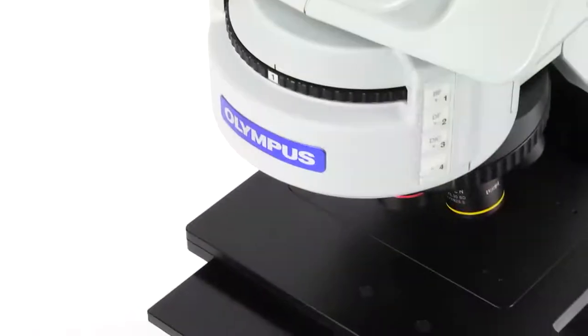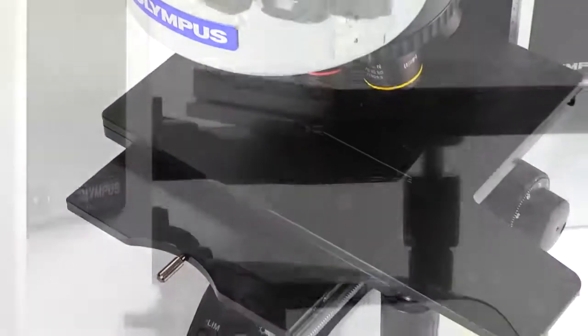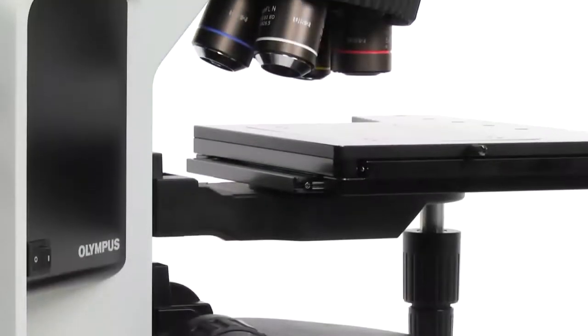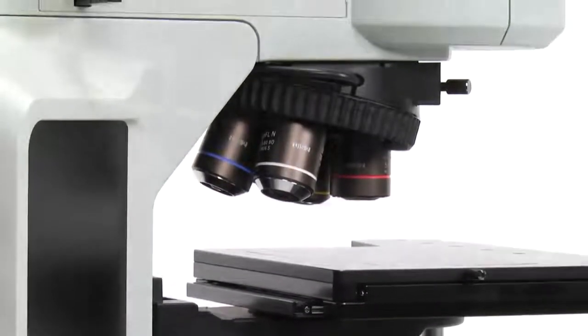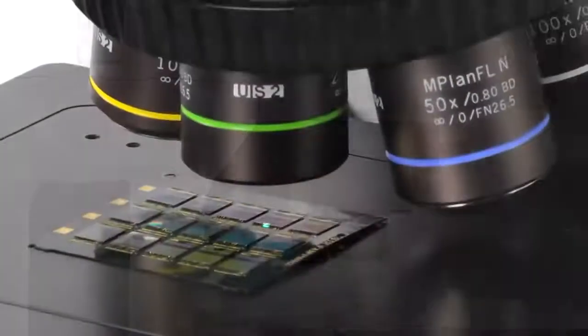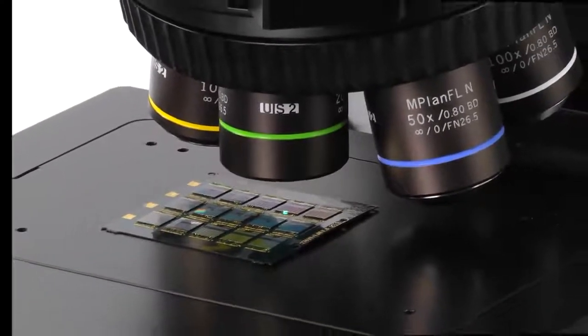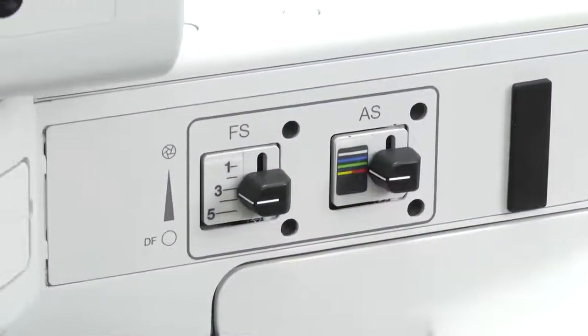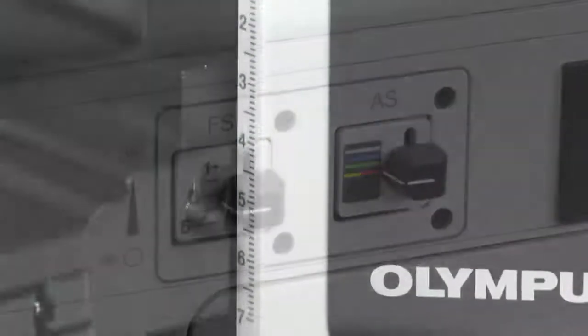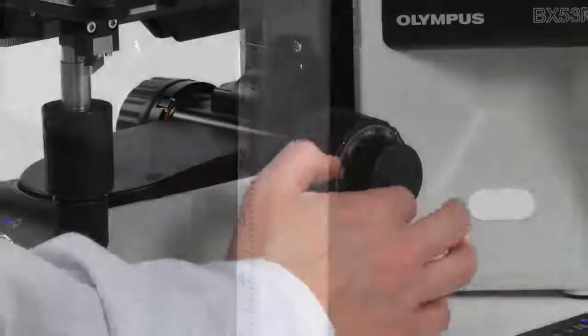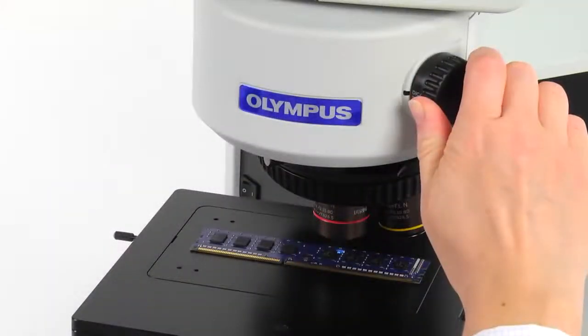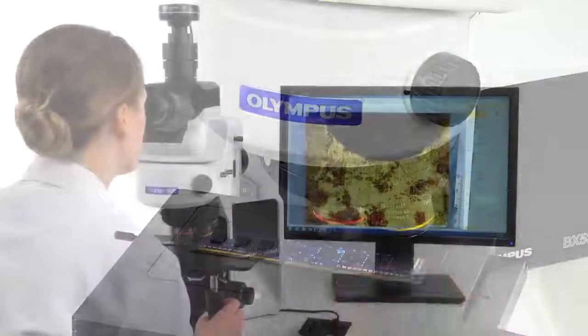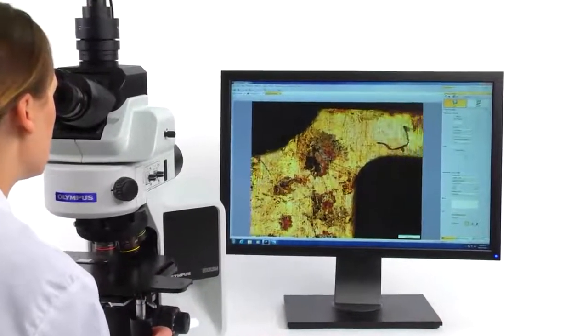The Olympus BX3M series of upright microscopes has been developed and designed for industry and materials science. Newly configured hardware guides the user to achieve optimal illumination and focus, making the microscope easy to operate. Together with Olympus Stream image analysis software.